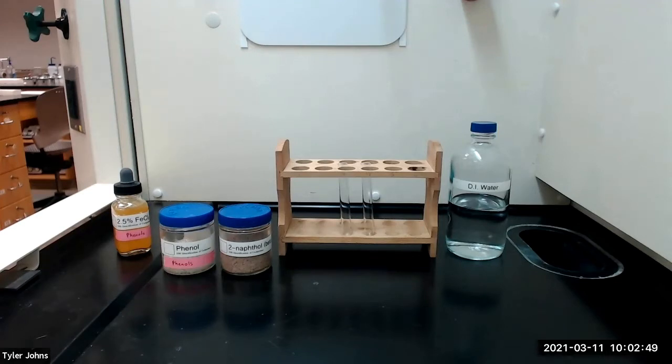The colors observed in this test result from the formation of a complex of the phenols with iron-3-ion. Some phenols do not give a positive result in this test, so a negative test must not be taken as significant without other adequate evidence.